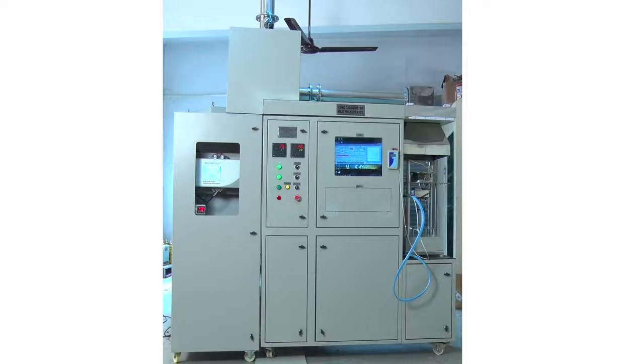We welcome you to introduce our new product, the Cone Calorimeter, also known as the Heat Rate Release Test Bench, built by our team Jupiter Electronics. This machine is capable of measuring the Heat Rate Release of any material, and it is built according to ISO 5660 Part 1.